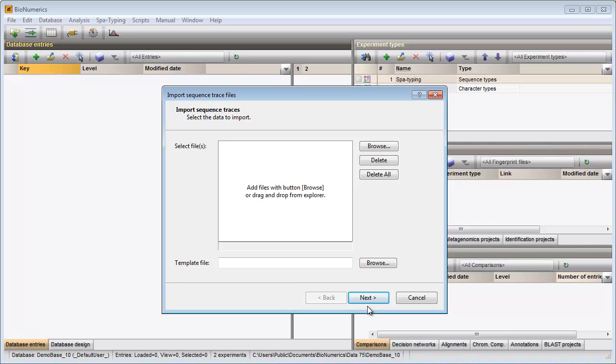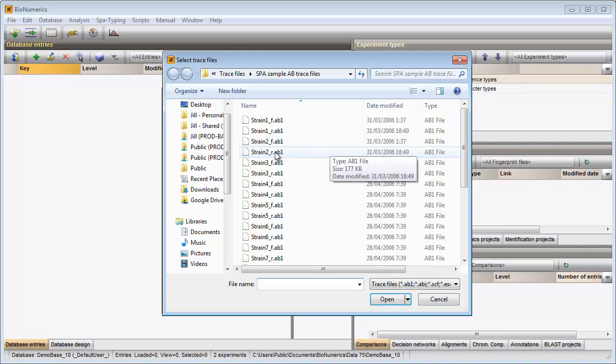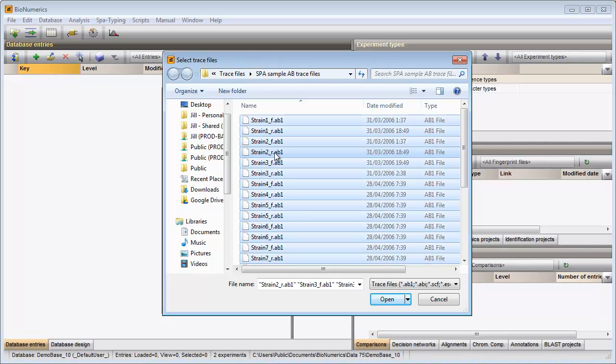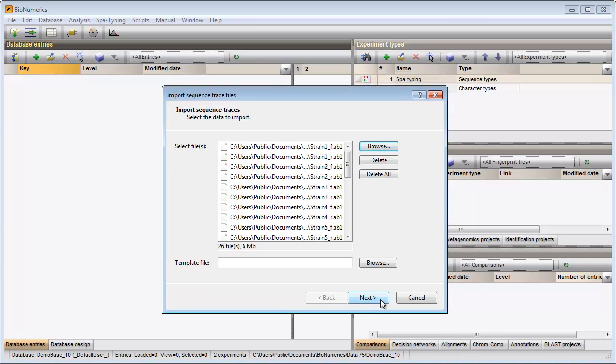In the first step I need to browse for the files. I select all files and click open. All files are displayed in the input dialog.